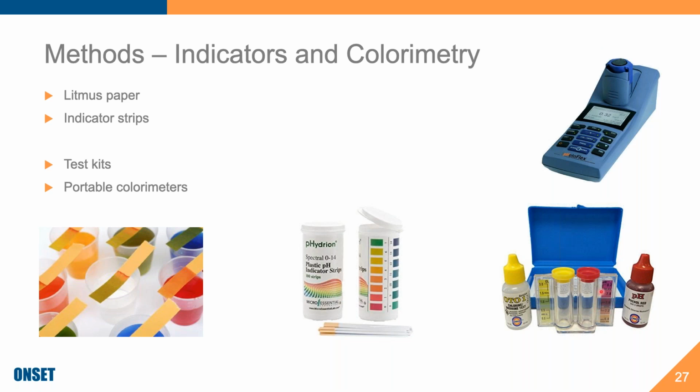This can be adapted essentially to become automated. Instead of your eye looking at this, you use a photometer and you are able to do the same thing: drop some drops in, put it into the photometer, and the photometer will tell you what the pH is. This could have better accuracy than all the three at the bottom here.